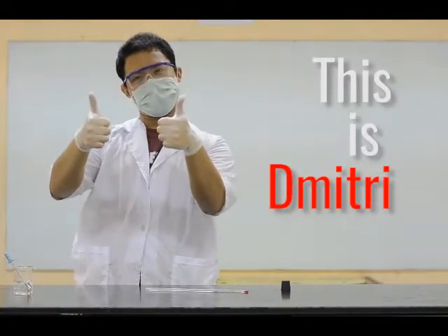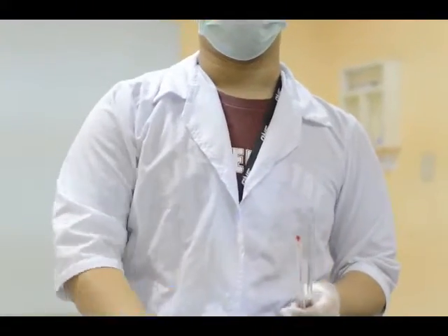This is Dmitri. He practices lab techniques that minimize the hazards in the lab.